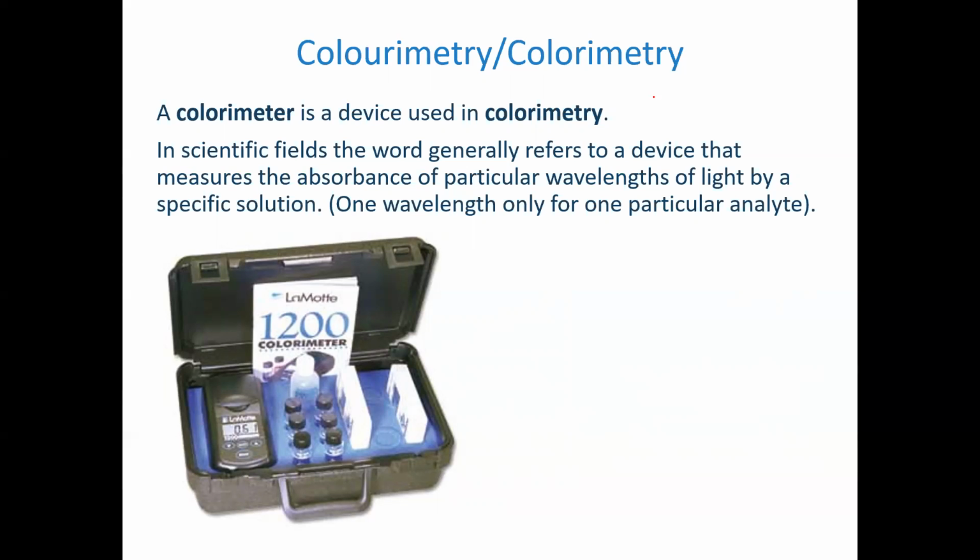You've got a light source, so here's my little light bulb. That's a light bulb. You've got a sample. In this case, it was in a vial, so there's my little sample vial right there. Okay, that's a terrible drawing of a vial. The light goes through. There's my light bulb, and then here's an eyeball. That's a detector, right? Don't know how to draw a detector.